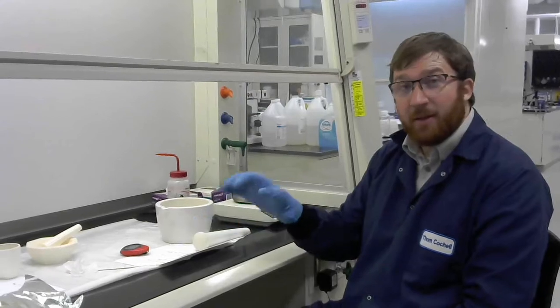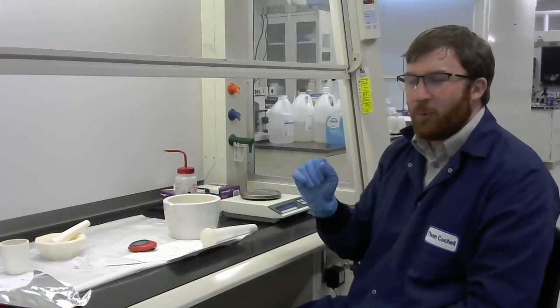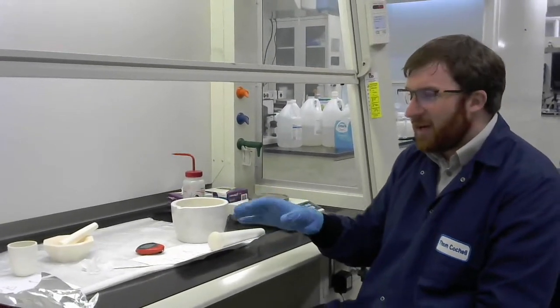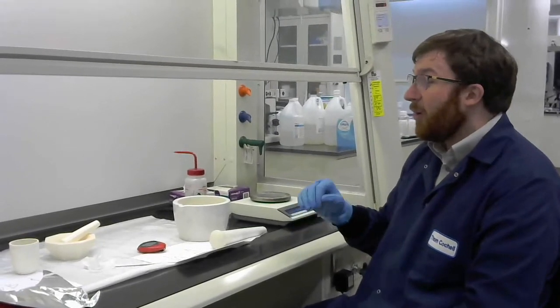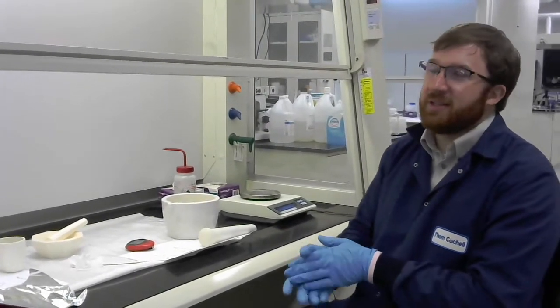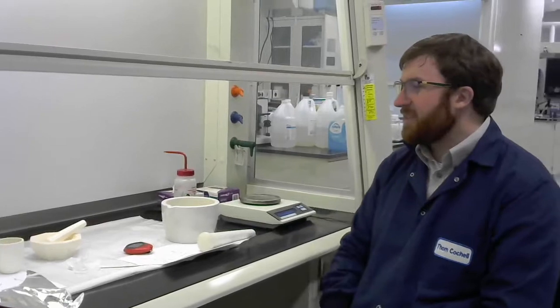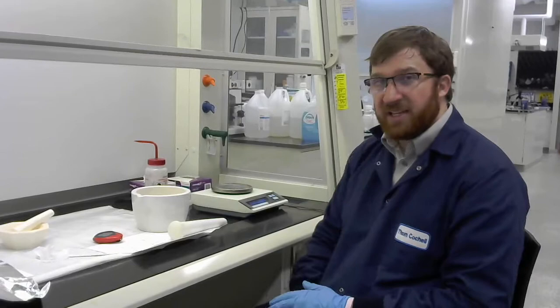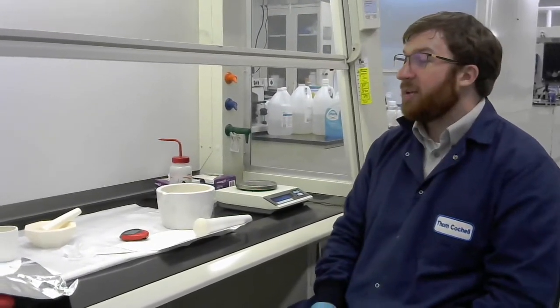Alright, we are back. We have our calcined powder out of the furnace. We weighed it in the last video and now what we're going to do is get to the fun part which is the milling or grinding step. This is going to look very familiar to the milling that we did before we calcined the powder. It's very similar, only the state of the powder is different now.